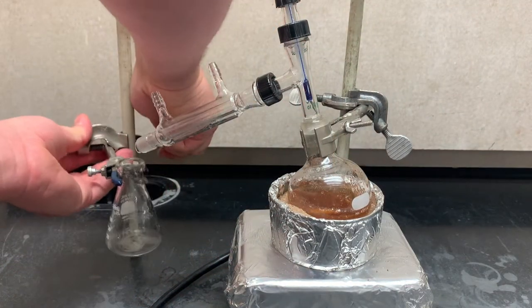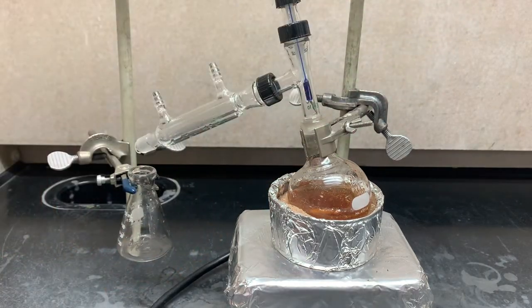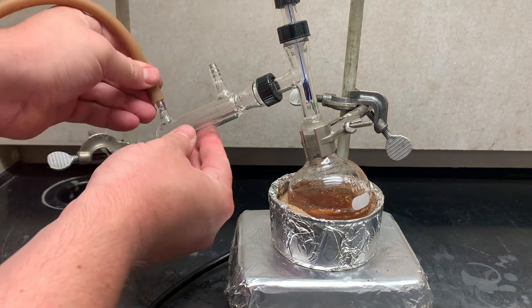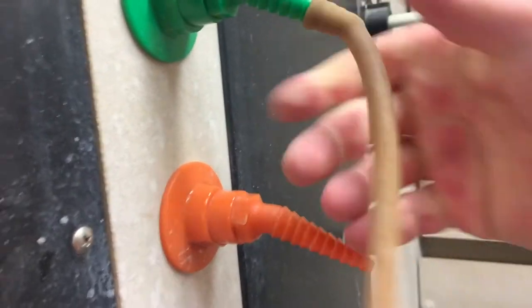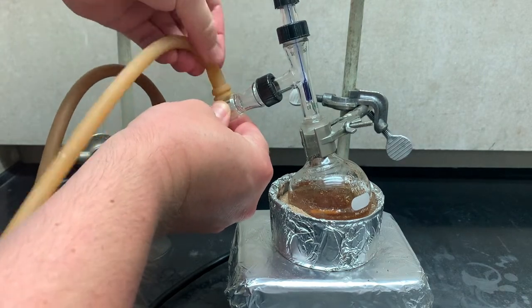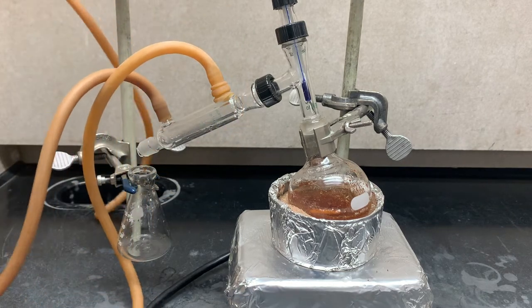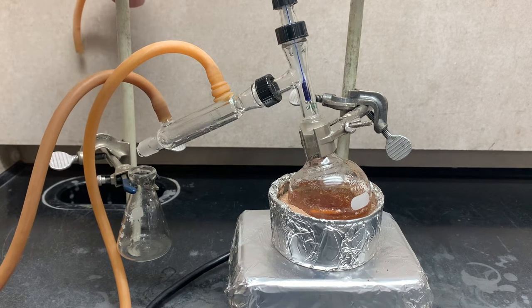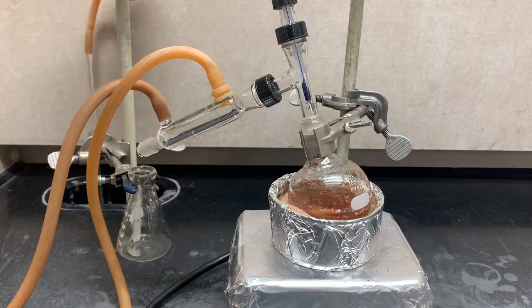And put this in the correct position. Now we're gonna need some latex tubing, and as always, in through the bottom. And out through the top. That feels a little loose, so we're gonna get not a lot of extra material there. And over. Just want to make sure that we have a nice steady flow. That looks about right.